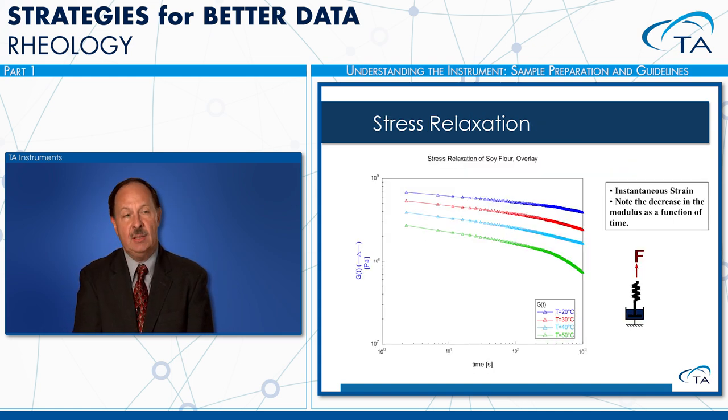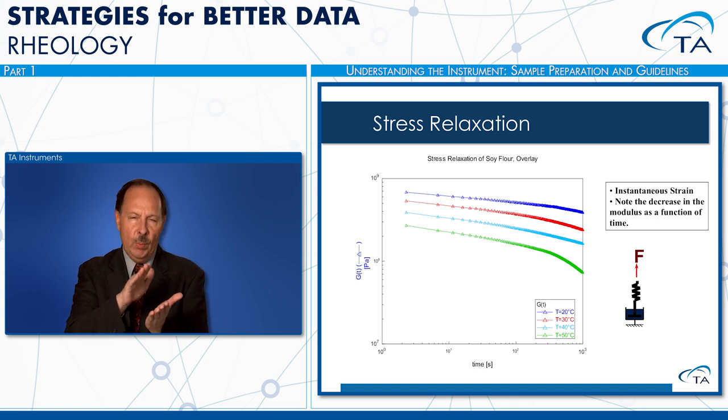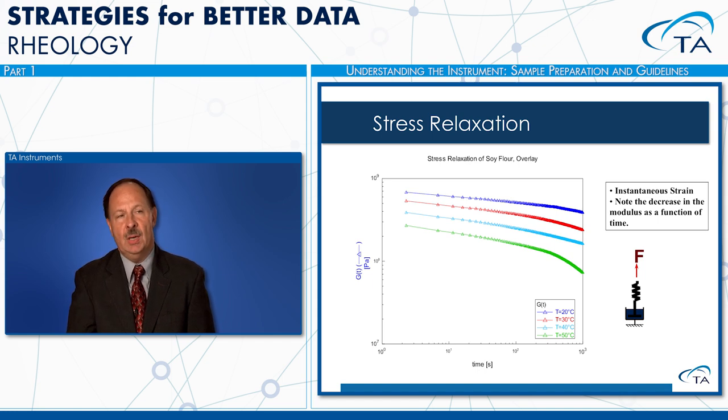One of the tests that you can do with our instruments is called stress relaxation, which is a test that is illustrated here. With our instrument, we would rotate the upper plate if we were doing parallel plate testing, and we would just hold it in that position. For the material that we have here, which is soy flour, the stress will decrease as a function of time. This is, as I said, what we call stress relaxation.